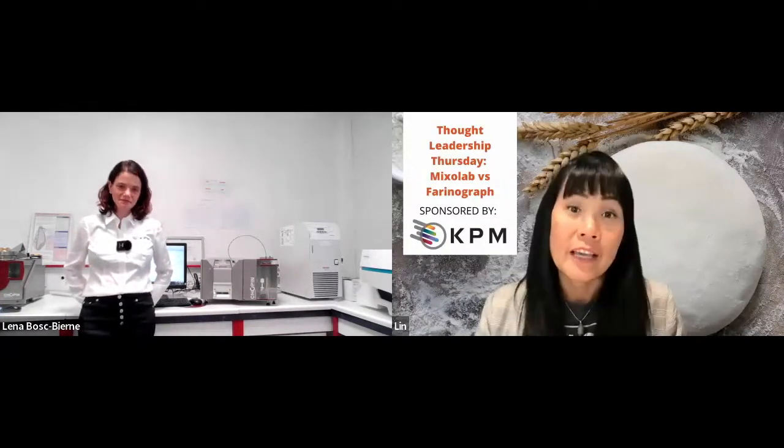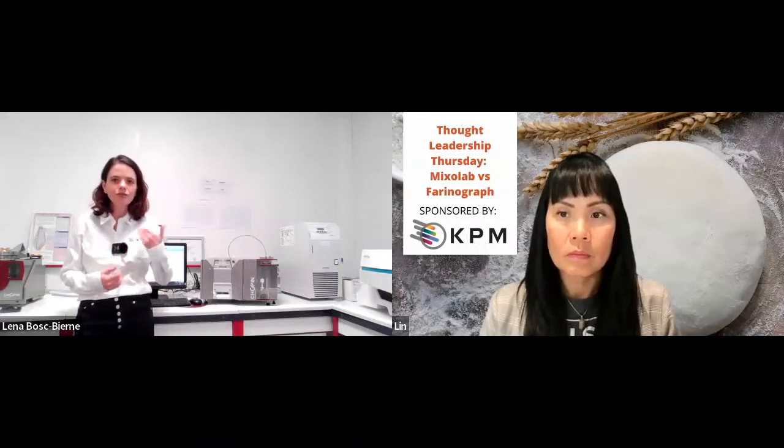That's great. What are some of the key quality parameters bakers can explore with the Mixolab? Well, by mixing the dough and by changing the temperature at the same time, the Mixolab kind of simulates the constraints that the dough undergoes during the production process and allows to access many key parameters. So at first, the dough is being mixed with water, which allows to determine the water absorption capacity of the flour. And of course, measure the characteristic of the dough during mixing, such as development time, stability, weakening, all the traditional parameters.